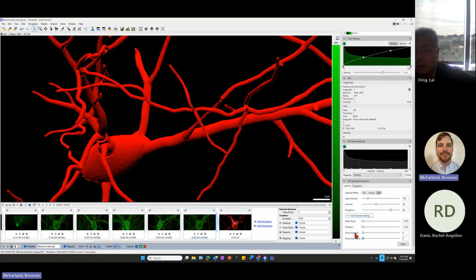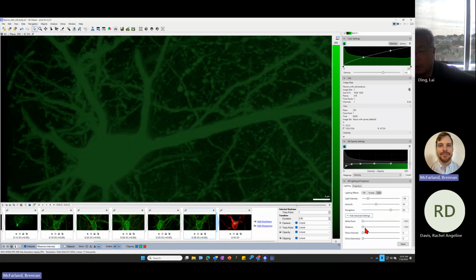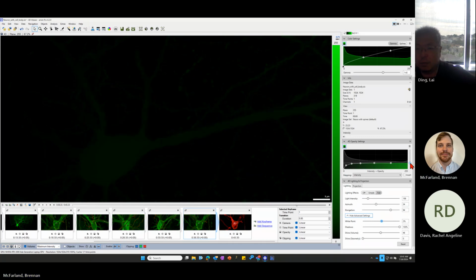So there are two different options here, shine for volume and shine for geometry. Volume is going to be your intensity information, so based off of the histogram. So if I do this shine for volume, that is what should be adjusted. So let me turn off these objects. So we're adjusting the volume data here. Bring this back up.